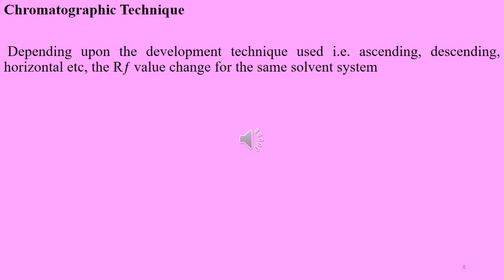Last one is the chromatographic technique. Depending upon the development technique, namely ascending, descending, horizontal, etc., the RF value changes for the same solvent system.